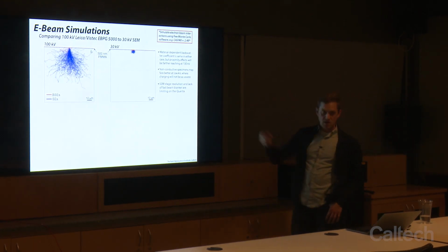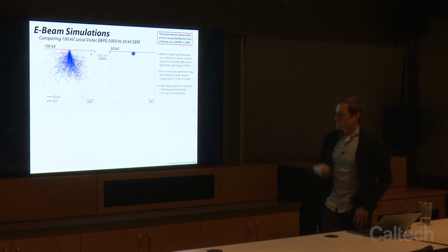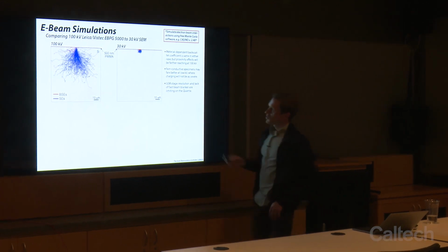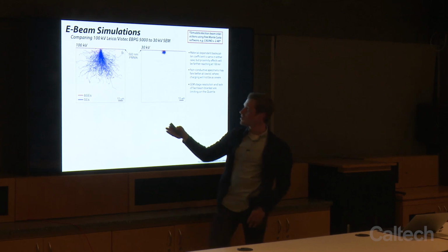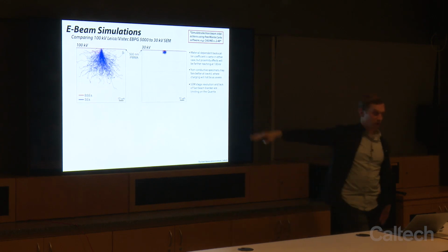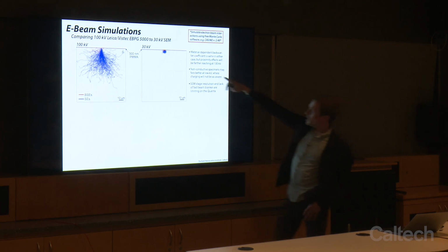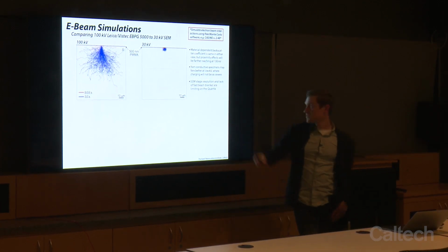So a lot of people in our lab especially are doing e-beam lithography to pattern the different parts of their devices. And so when you do that on our electron beam pattern generators, they're 100 kilovolt. So at 100 kV, we know our electrons have 100 keV, and they're actually going to penetrate about 80 microns into silicon. Whereas we talked about with 30 kV in an SEM, it's about 8 microns. So you have a full order of magnitude difference there.